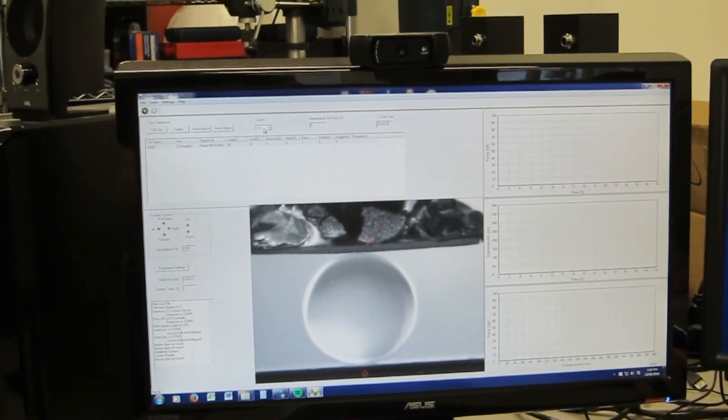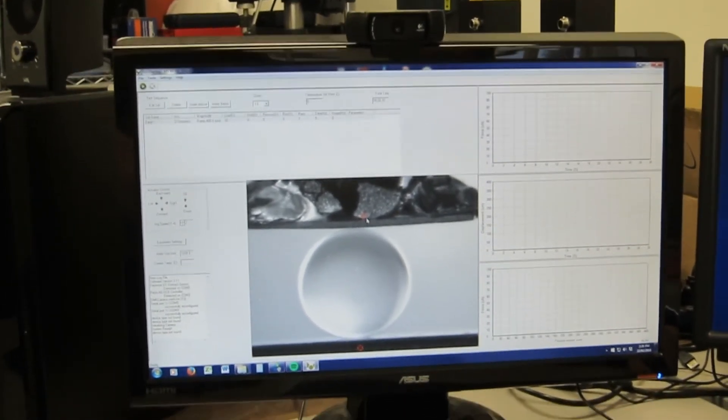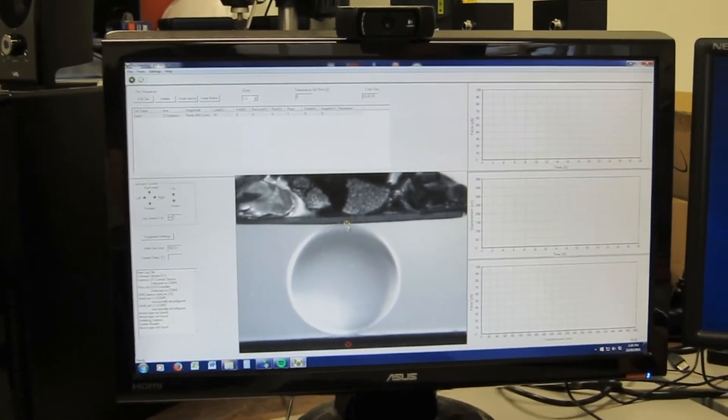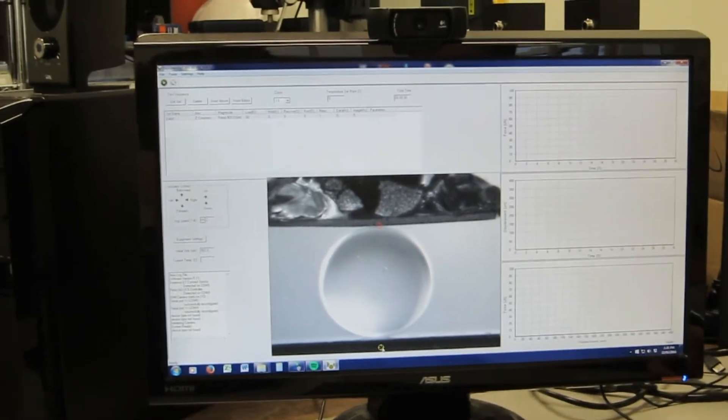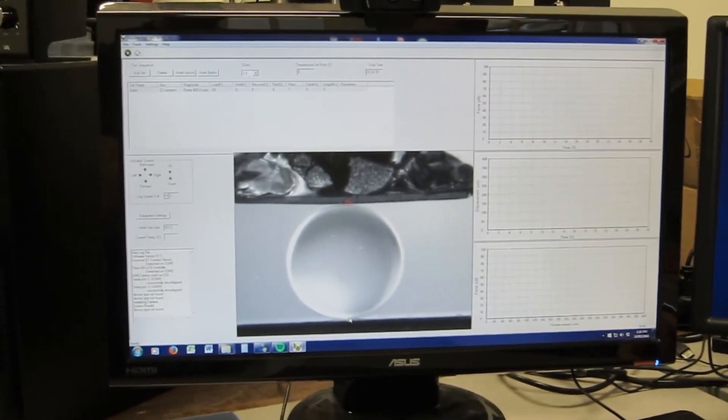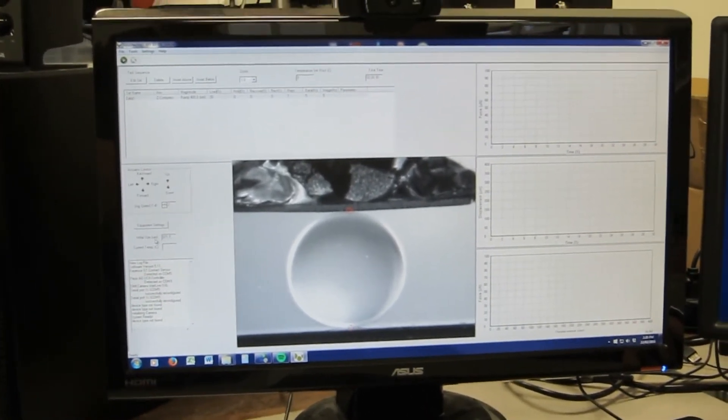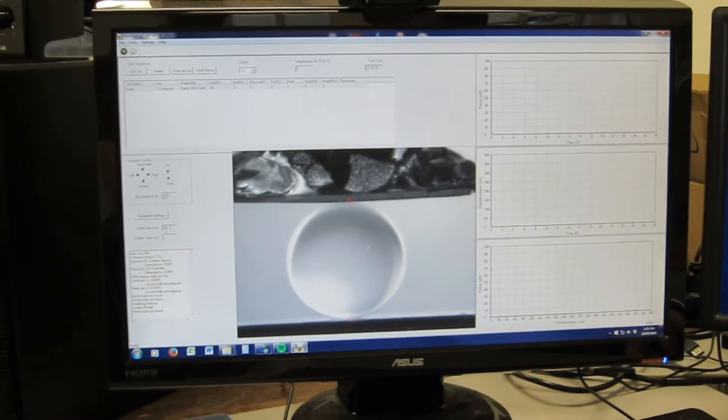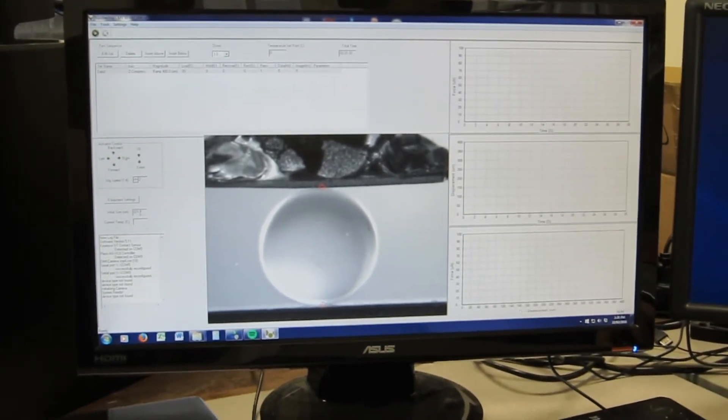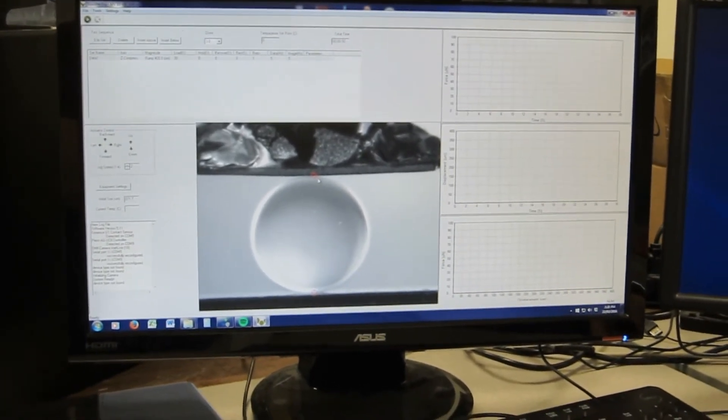I've set the zoom to three and if I move the crosshairs then on the top and bottom of the specimen, that will fix the specimen size which in this case is 871 micrometers.